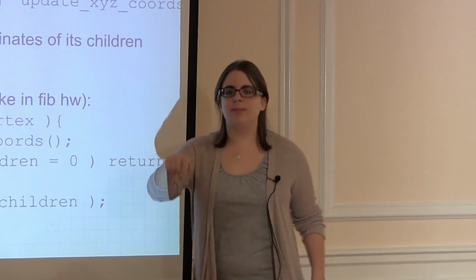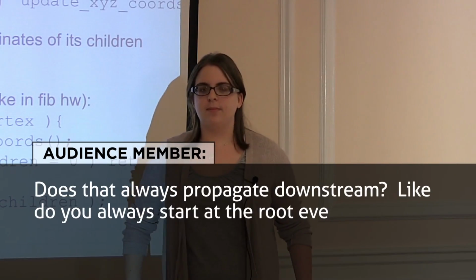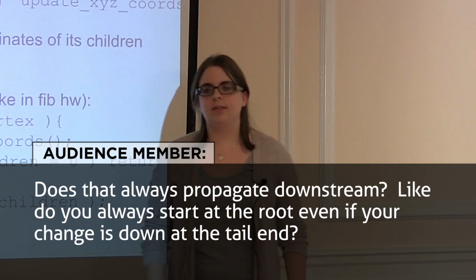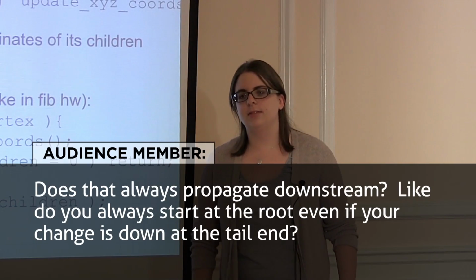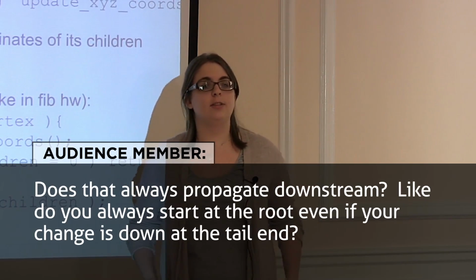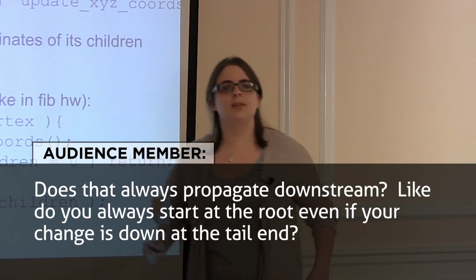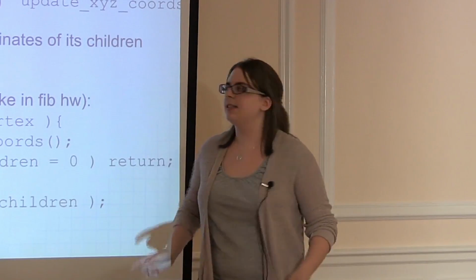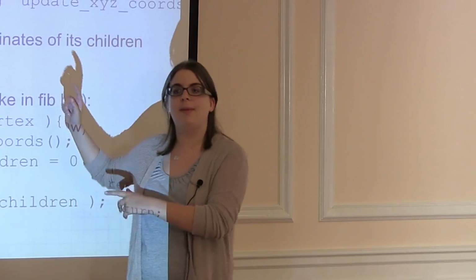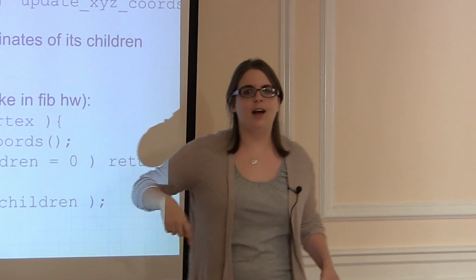Mary? Yeah? Does that always propagate downstream? Like, do you always start at the root, and even if your change is at the tail end, it always starts at the root? So the question is, does the change always propagate downstream based on where the root is? This is something that we're going to talk about in a couple minutes, how you might want to change that and the benefits that you can get. You can change the direction of some of those arrows.